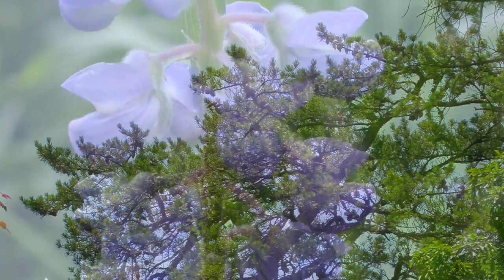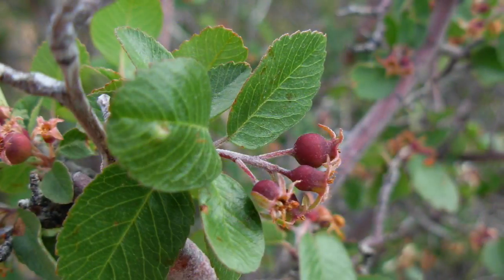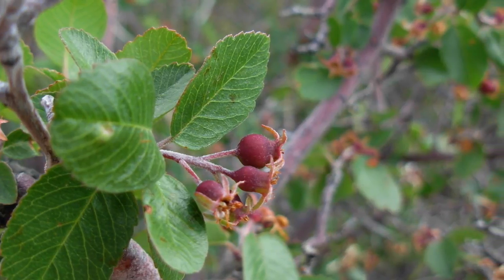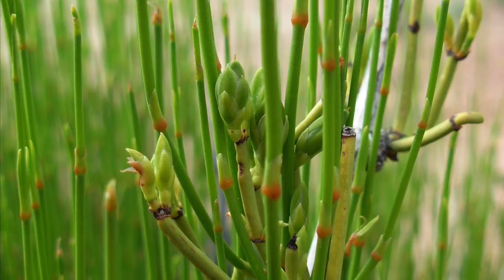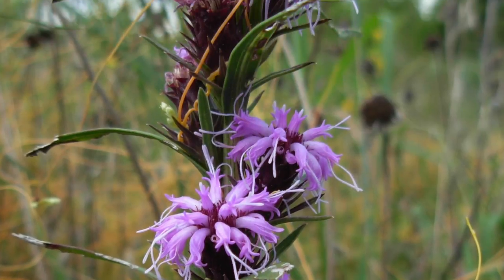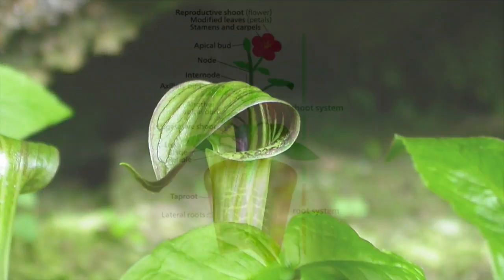Although they can appear quite different on the outside, plants show a fundamental similarity in basic features of the organs that make up the plant body, the organization of tissues into organs, and the features of cells that make up those tissues. This video explains the basic features of plant anatomy that underlie the diversity of form and function observed in plants and describes a simple technique to observe the different types of cells found in the herbaceous tissues of some common fruits and vegetables.